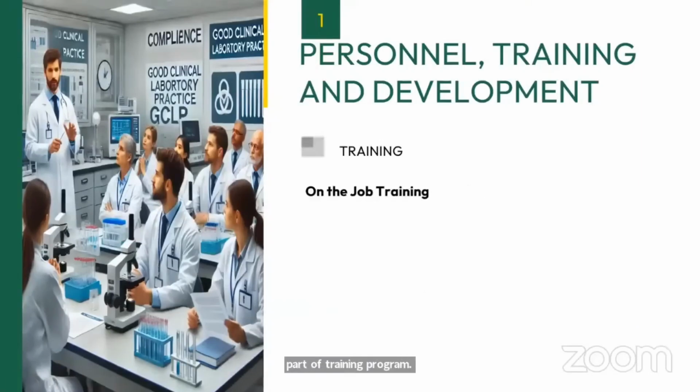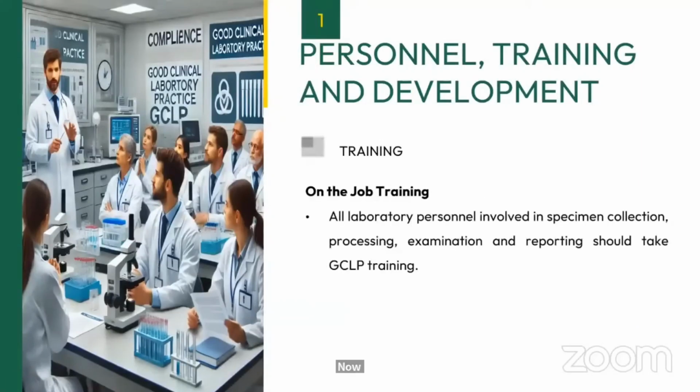Now, after induction training, there is on-the-job training. So basically, it is a continuous training. All laboratory personnel involved in specimen collection, processing, examination, and reporting should take GCLP training. This is given in the document itself. This is not something I have put in this presentation on my own; these same lines are in your GCLP document. It mentions that all the personnel involved in specimen collection, processing, examination, and reporting should be trained in good clinical laboratory practices. It is mandatory to participate in this training program.